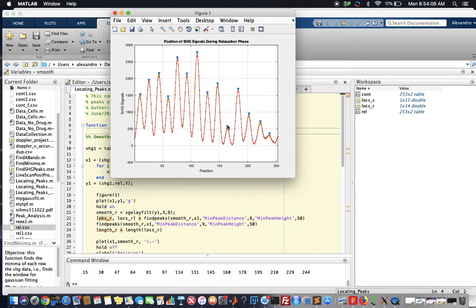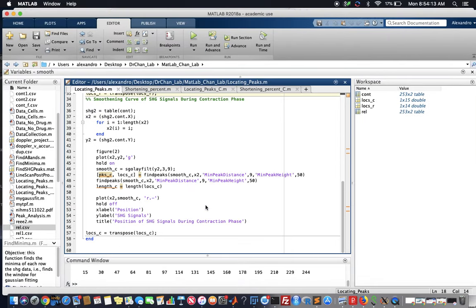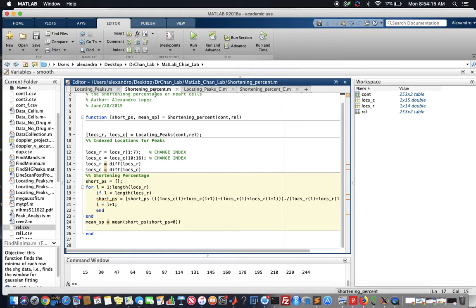All right, so on to the shortening percentage here.